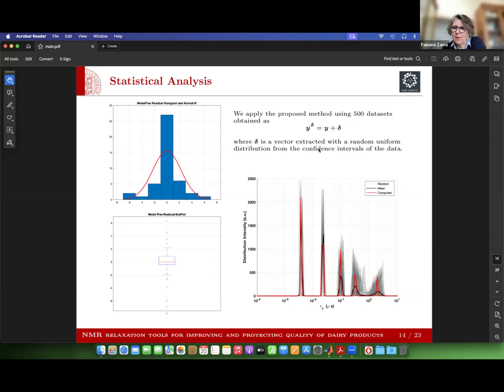Yes, it is so. But the problem here is that there is no unique representation of that. This transformation is not injective. So you can have different types of distribution that give you the same profile because of this type of kernel, because of this type of transformation. And this is the reason why, if we add constraints, or change the way in which we sample our distribution of times, we can have different clustering. This is the problem.